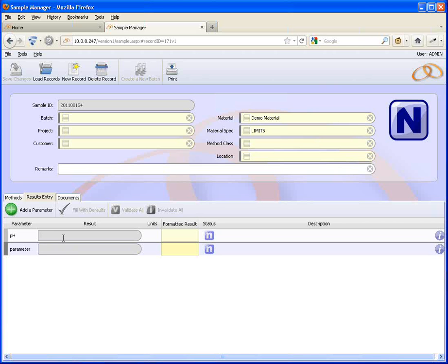And the reason we've got a new status is if you are creating your samples in the database in advance of the physical samples actually being taken or the physical samples arriving, there's a provision to have a separate receipt stage. So when a sample is status N, it just means the sample has been created within the Qualoupe database, but we're not implying that you've actually got your hands on the sample at this point.